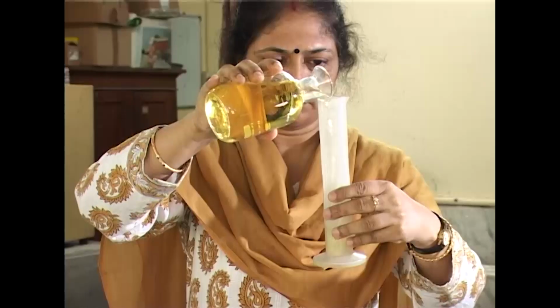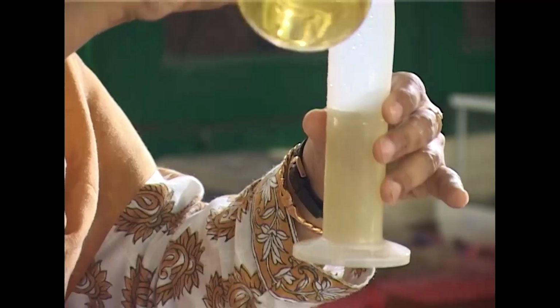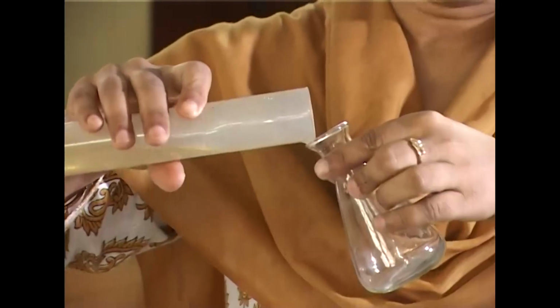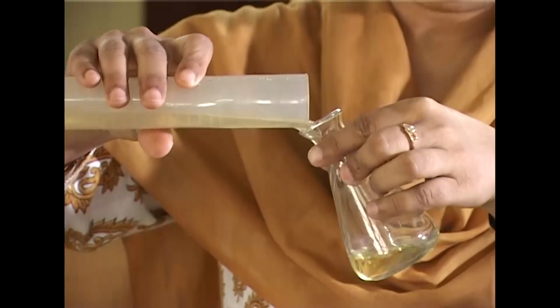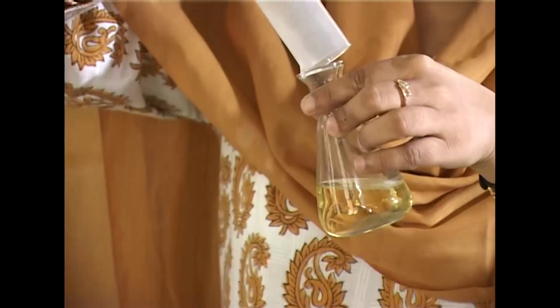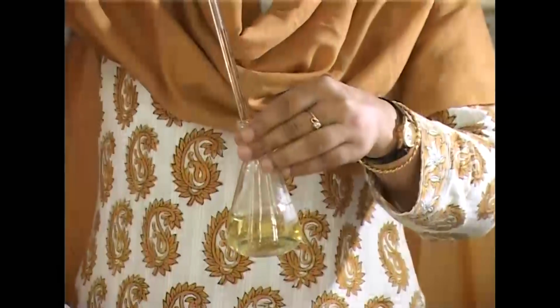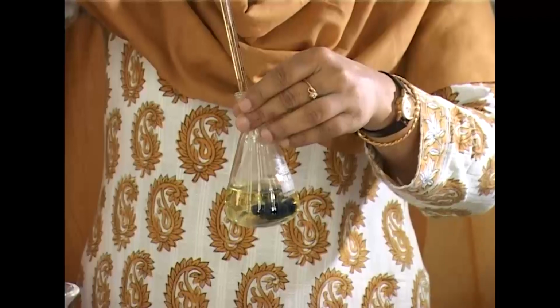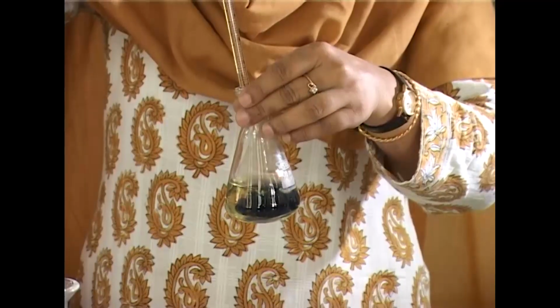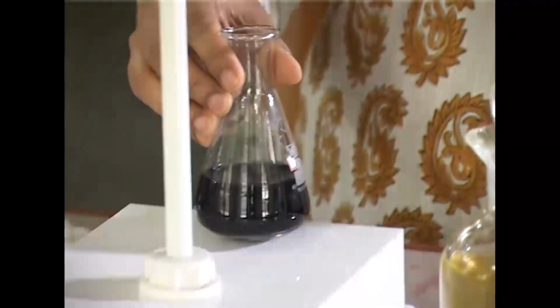Now, this BOD bottle has 250 to 300 ml of water, and the whole thing could not be titrated at once. So we go in for 3 titrations. In each flask we take about 50 ml of this treated water, and to it we add 1 ml of the starch solution, and after this addition we find a blue-black color develops because of the presence of free iodine, and this is titrated with sodium thiosulfate.